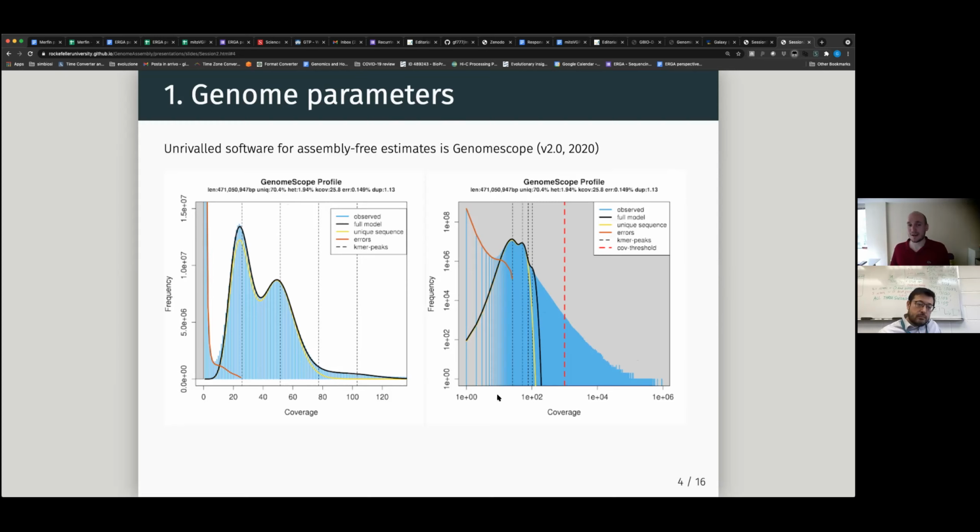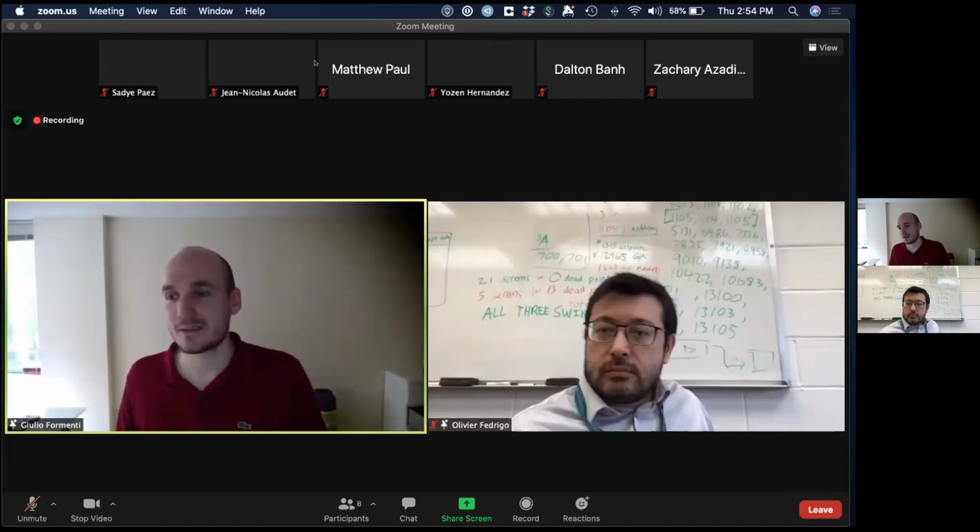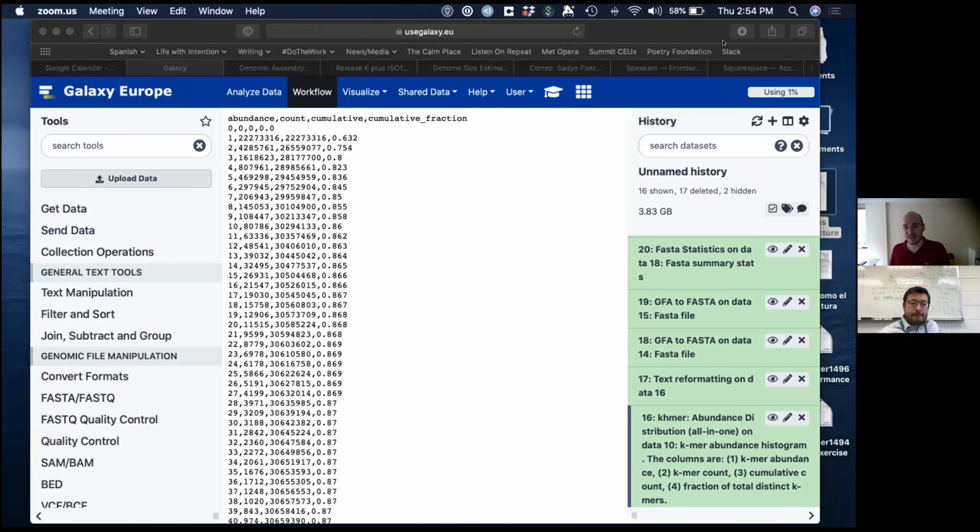Okay, so did anyone have the chance to run this on E. coli or some other sample? Want to share your screen and show us? Can stop sharing. Did you or not? I'm going to stop sharing my screen anyway. By the way, my FastQC in the meantime is done, so I was able to download the data, but we're still running the assembly.